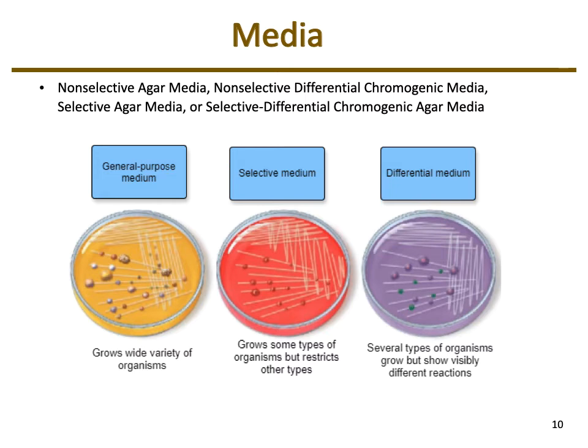Just keep in mind that if something's growing on a selective or differential media, some of those colony morphology indicators cannot be utilized because we've altered the environment from what we would normally see. With a general purpose media, things like pigment and color can be seen because we're not adding reagents into the media that cause the bacteria to change color.